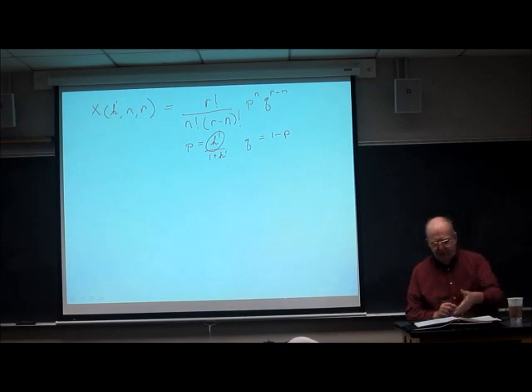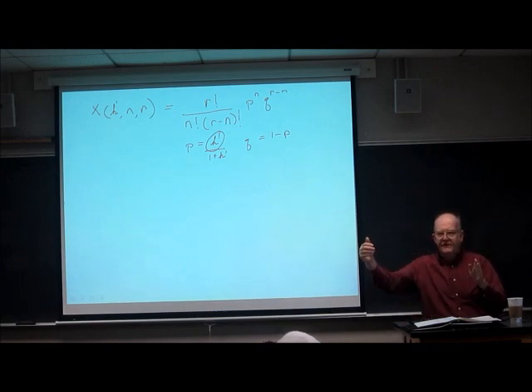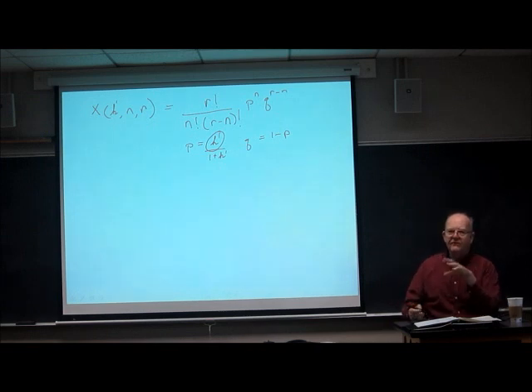Okay, now this equation, nobody likes it, and don't memorize it. It's just useful for seeing what's going on when you've got something to do the calculations with. But based upon the plots I just showed you, what it's predicting is a distribution of the solute in the different tubes. That depends upon how many transfers you do and depends upon the K prime factor, the retention factor. All of those change the fraction that's in a given tube.